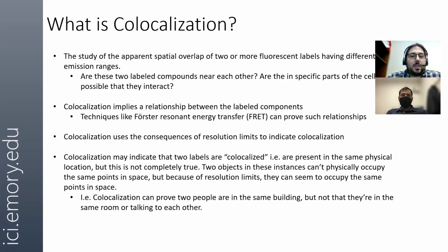There are limits. There are resolution limits that play an effect in how data should be interpreted, and even when colocalization is applicable. And to mention as well that colocalization doesn't necessarily mean that two objects are right on top of each other or even attached to each other. It merely provides circumstantial evidence.